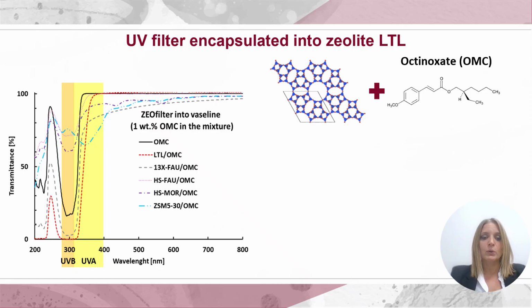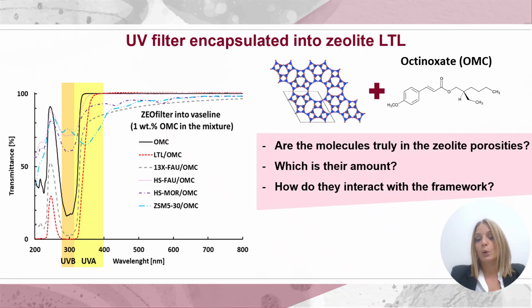Despite now being sure that our LTL is the perfect zeolite, and having been able to enhance the performance of the filter a little bit, we have some questions. First of all, is the molecule truly inside? And what is the host-guest interaction between the trapped molecule and the framework? To answer all of these questions, we need X-ray powder diffraction, and we also use spectroscopy to couple X-ray powder diffraction with spectroscopic results.